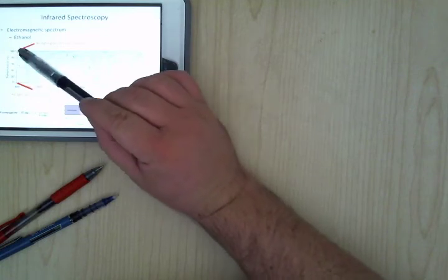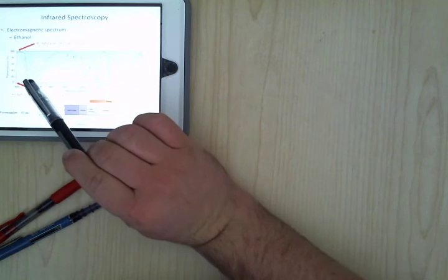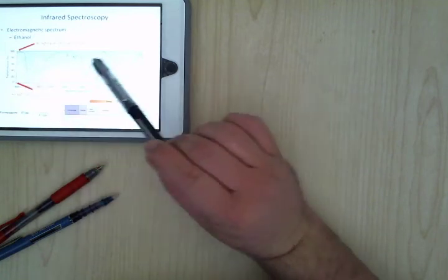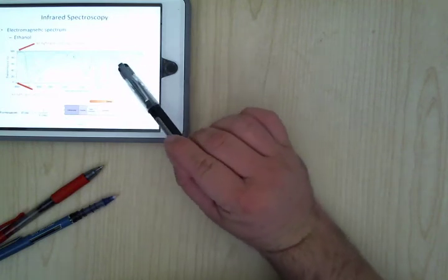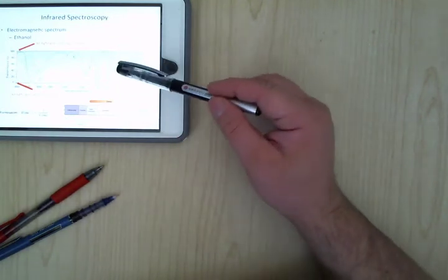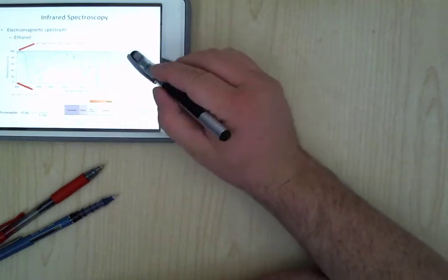So this is the important peak here at 3,400, and we look at the maximum part of the peak, right? There's a peak here, a peak here, a peak here, and there's kind of something going on right there, but I'm not sure what's going on there. Something's happening, but it's absorbing the light too.